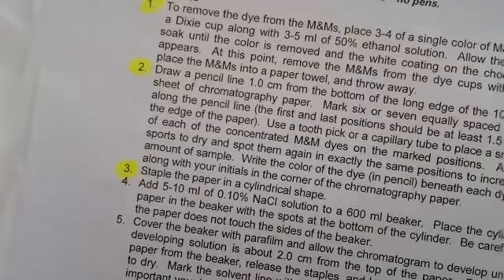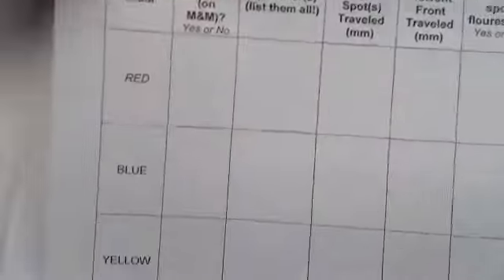There are 6 different colors of M&Ms. The second page of the procedure packet has your data table. Here are our 6 colors.